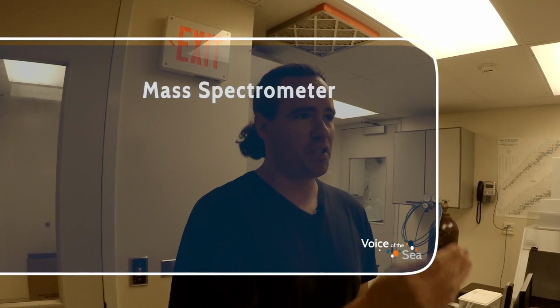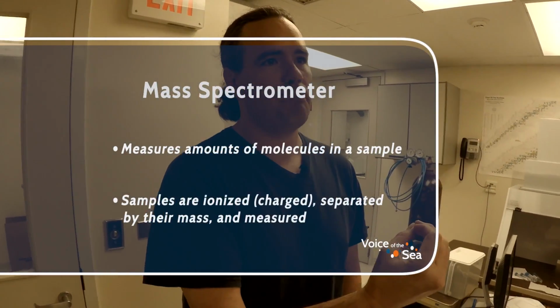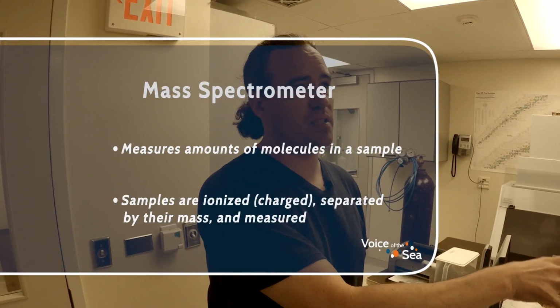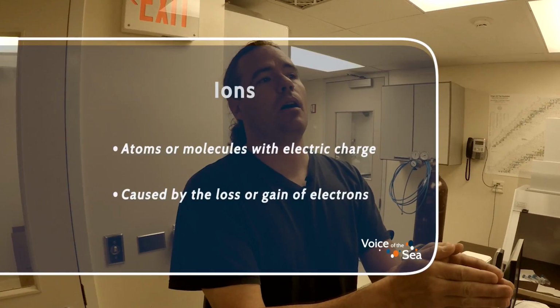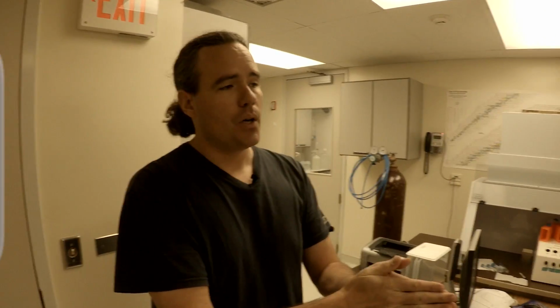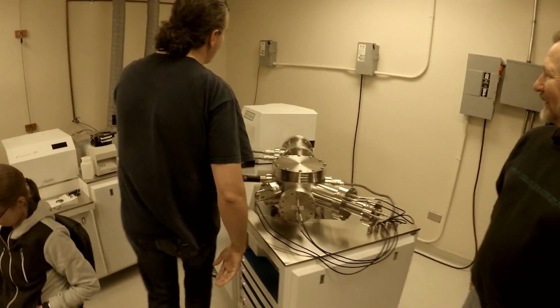This is a mass spectrometer. So when you think about a light prism, it separates the constituents of light based on wavelength and produces a spectrum. This also produces a spectrum, but here we start with an ion beam, like a beam of charged atoms. And instead of separating them based on wavelength, here we separate them based on their masses. So most of the mass separation basically happens right in here.